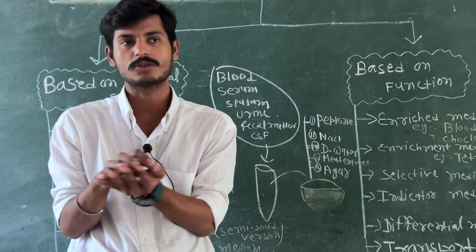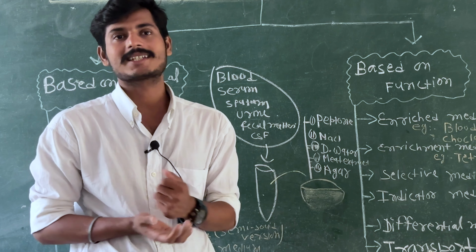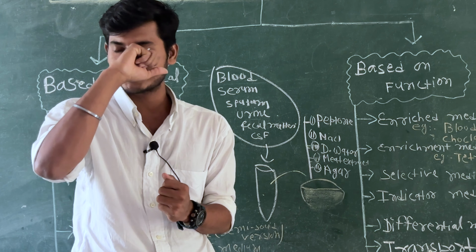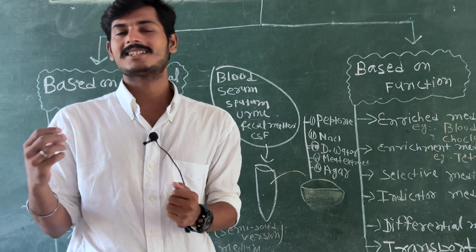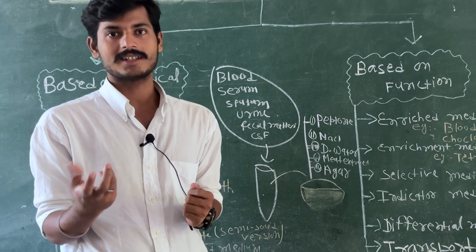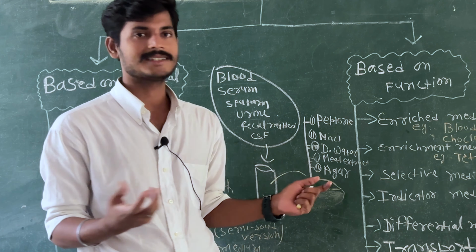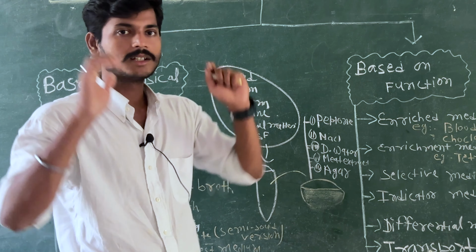बना देगा. एंड ये agar हम लोग बेसिकली एक्सट्रैक्ट करते हैं एक समुद्री घास से, और seaweeds, okay, called as the Gelidium species is a grass species, okay? ये घास का एक जाति है जिससे हम लोग what बनाते हैं, it's a agar. Okay, agar, Gelidium. Clear? No problem?